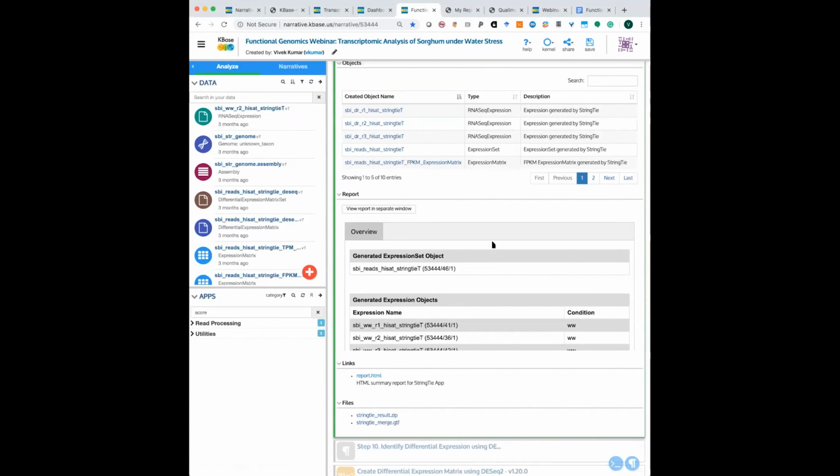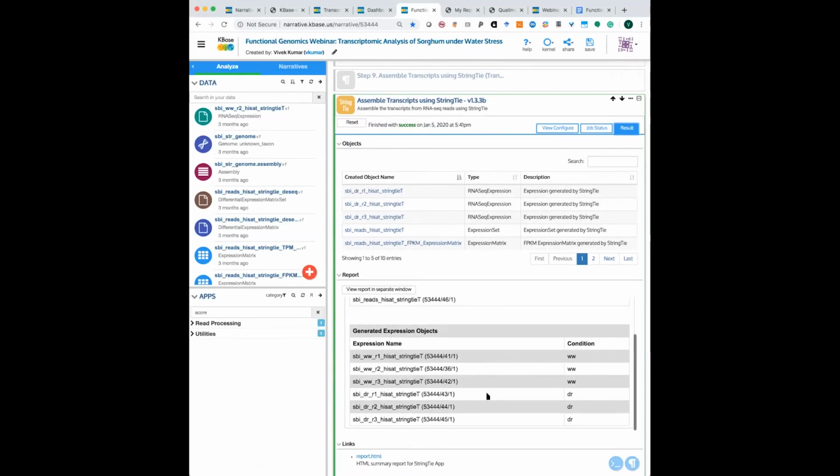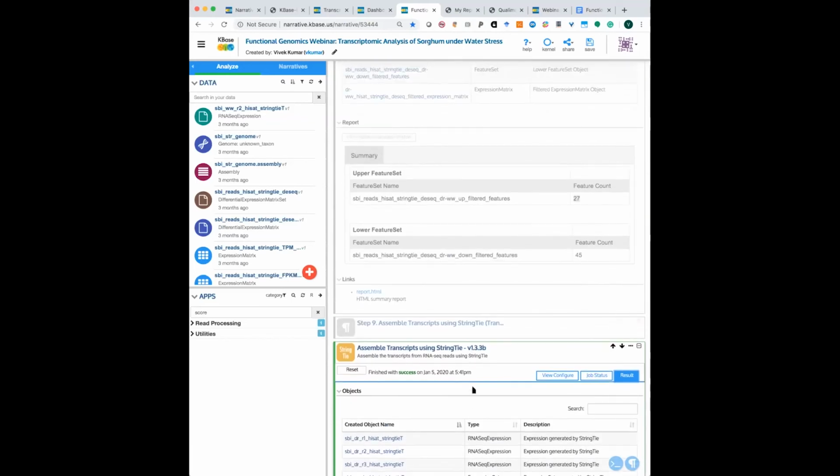And for the transcripts, it also has a de novo transcriptome StringTie merge. So if I'd like to visualize, I can download it and visualize it outside. I'll probably take maybe around 5 to 10 minutes, and then we'll see if we can use the remaining time for the QA, and the QA will continue after the session is over as well.